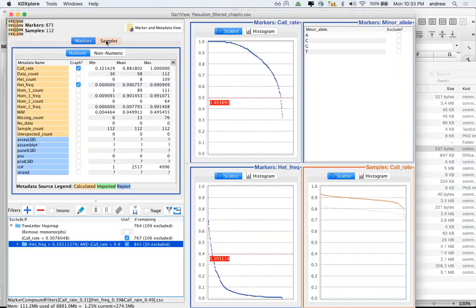I guess Dart because we're biased. Just to reiterate from the slides, it's the HapMap 2-row, the HapMap 2-letter, codominant, dominant, and SSR. And for the Dart data sets, it will be the SNP, both 1-row and 2-row, the counts format, and the Silico Dart data sets.